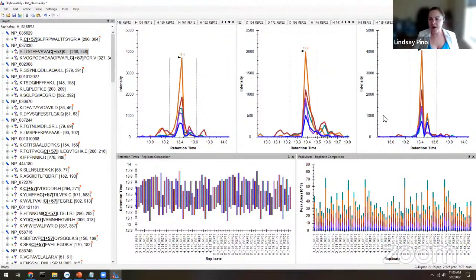For me, I had it kind of already arranged that way, so it didn't really change too much. Looks like maybe we're still doing good. So you should have something that looks generally like this.